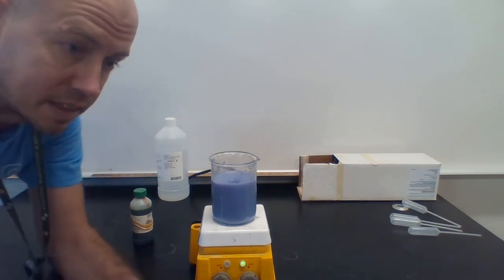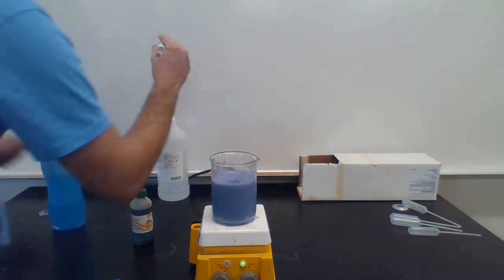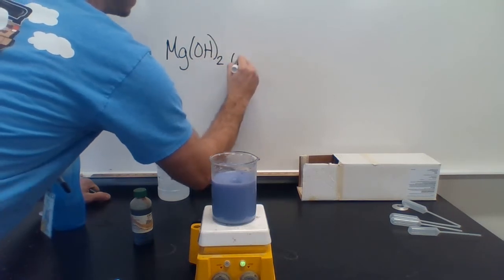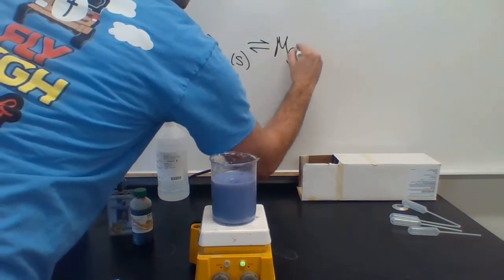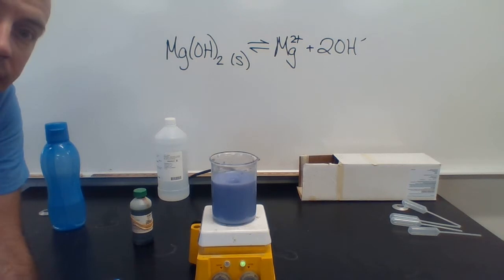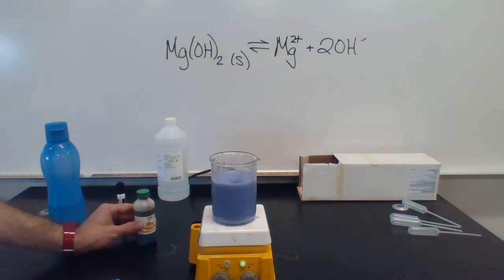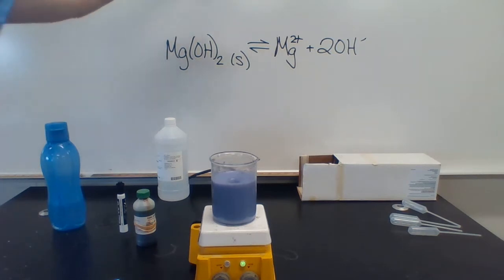So what we have in this beaker is the equilibrium between magnesium hydroxide as a solid and its two aqueous ions. So it breaks into magnesium 2 plus and 2 hydroxide minus. And that's an equilibrium back and forth. The ions are separating, the ions are coming back together, and we just have this constant back and forth representative of an equilibrium. But that also means that the amount of solid and the concentration of ions stays constant.